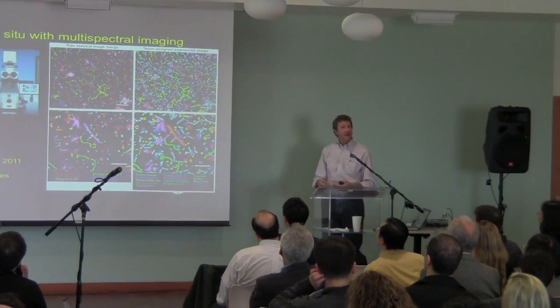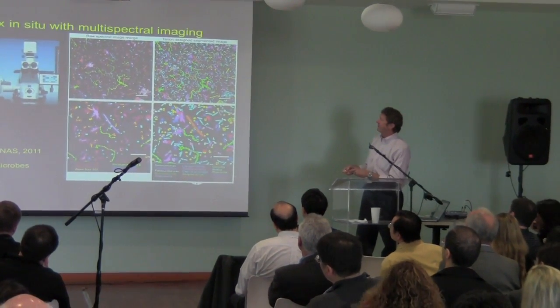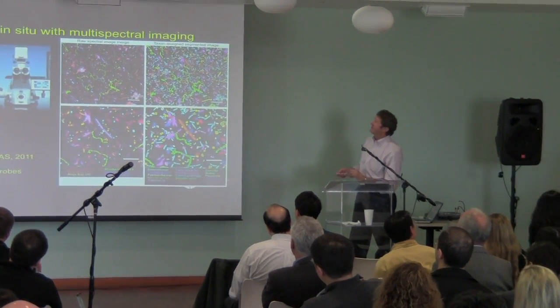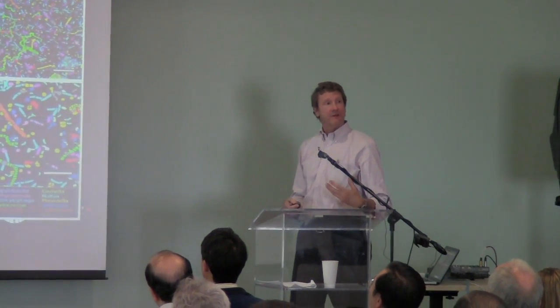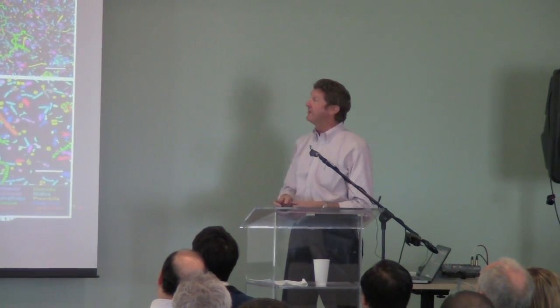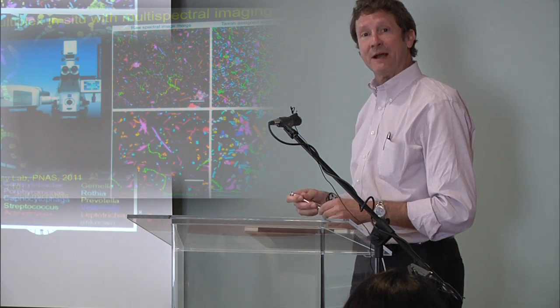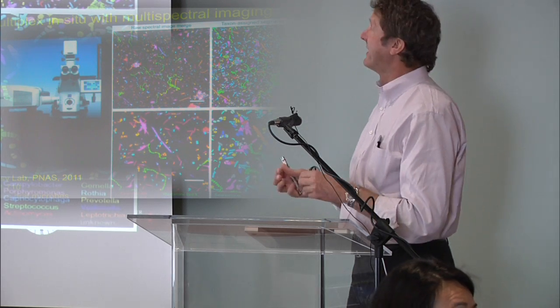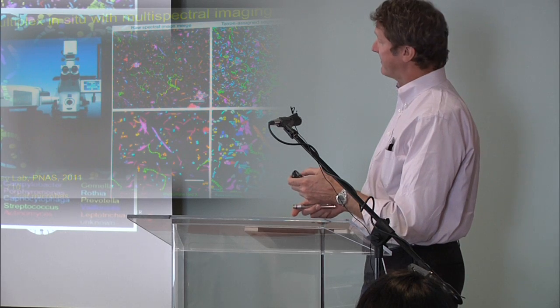Others have used these sorts of technologies to great advantage. So the Borisy lab, now at Marine Biological Lab in Woods Hole, has been using the next generation of these scopes, the laser LSM 710 from Zeiss, to follow up to 15 different labels now, and by multiplexing coding, he's following hundreds of different bacterial communities and looking at the bacteria within all of our mouths right now to understand the communities at the macro and the micro scale and the dialogues that are going on between those communities, both in health and in disease.